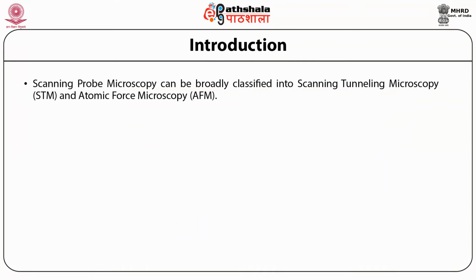Scanning probe microscopy can be broadly classified into scanning tunneling microscopy, that is STM, and atomic force microscopy, that is AFM.